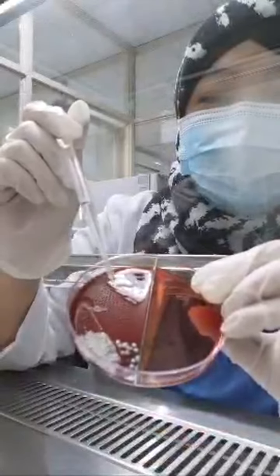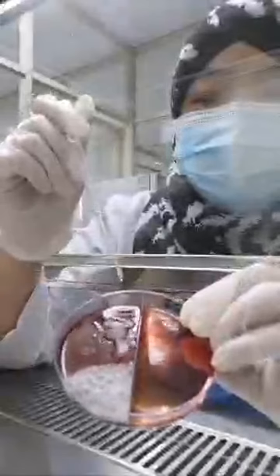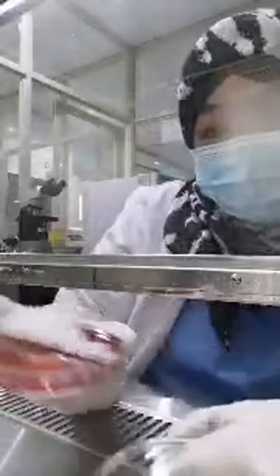See? This one will have bubbles. You see the bubbles? It's so cool, right? See, there are a lot of bubbles. So this means that it is Staphylococcus or Staphylococci. It's a lot of bubbles now, so I hope you can see it. This is one thing that differentiates it from the strep.